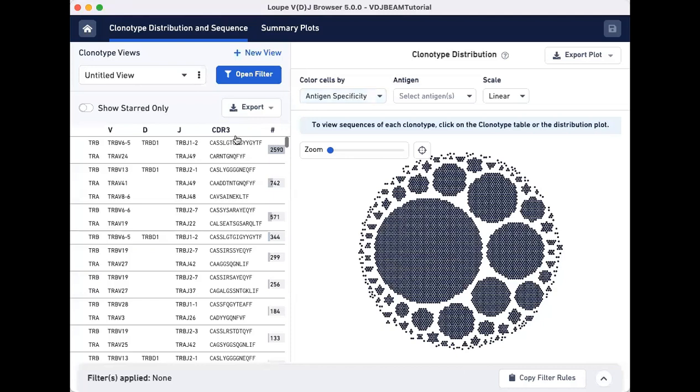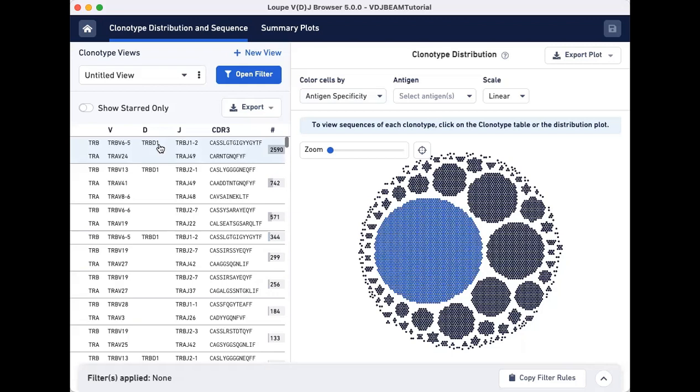The Clonotype Views panel on the left lists all clonotypes found in the dataset sorted from most abundant to least abundant.